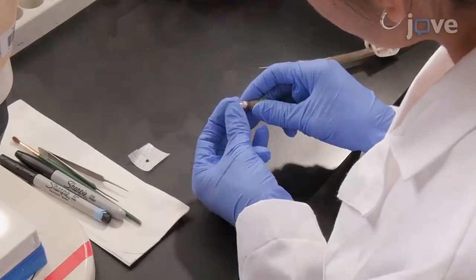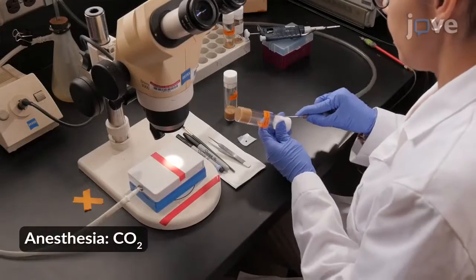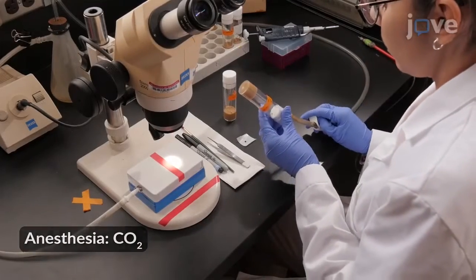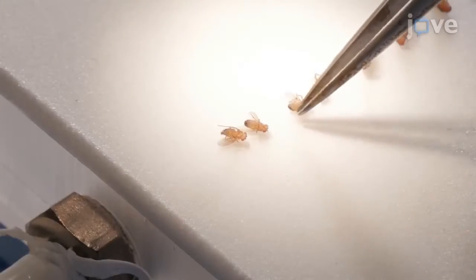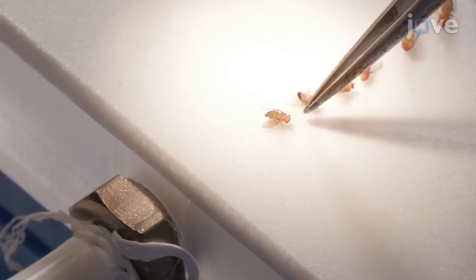Mount the needle into the injector nozzle, and line the anesthetized flies along their designated area on the fly pad, ventral side up, with the heads oriented toward the front of the pad.